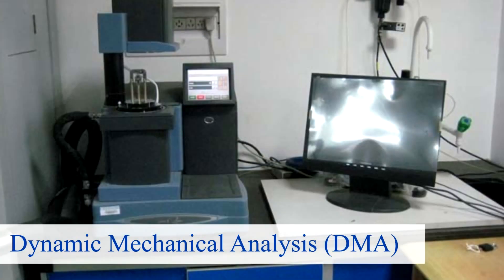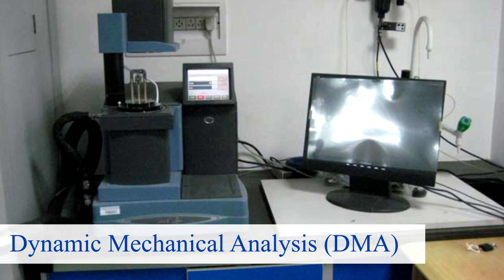Number one is dynamic mechanical analysis, also known as DMA. DMA is a way of identifying the regions within a polymer where it's transitioning, like its glass transition point. This is used to determine the quality of the material prior to blending, and it identifies small regions that cannot be found using DSC testing, which is a different type of testing.